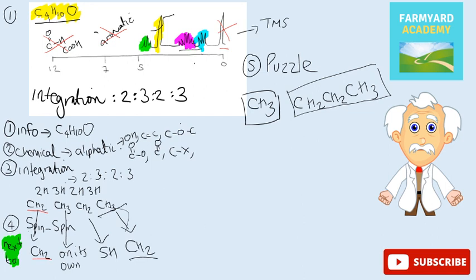And again, if you're showing your working out like this, you're going to get marks for this working out. So sometimes it's not always about getting the overall answer. It's about demonstrating that you can problem solve and you can figure things out. But that's quite tricky. But that's what we're left with. And then we're not finished yet, because those are our 2 puzzle pieces. But if we look, we're missing something. We can't just bring these 2 pieces together, because it wouldn't make this spin-spin pattern and chemical shift. So we must be missing something.